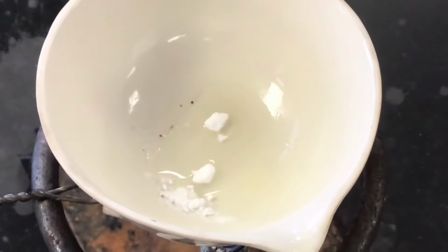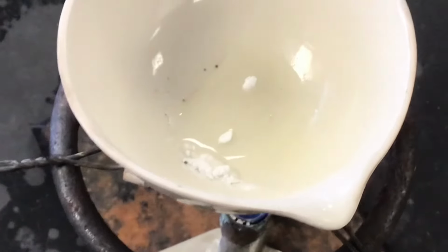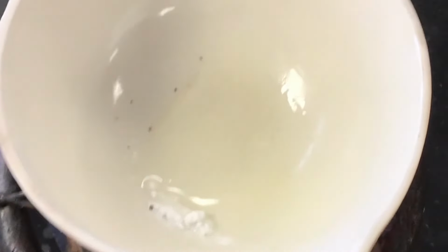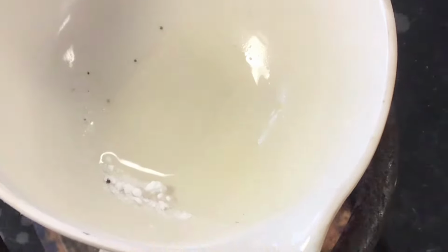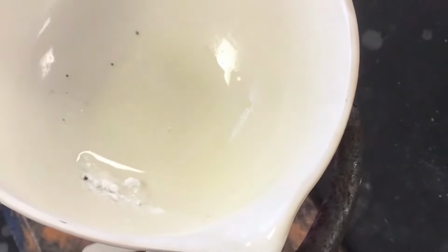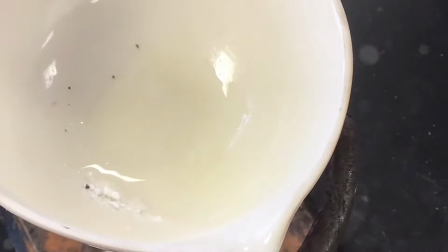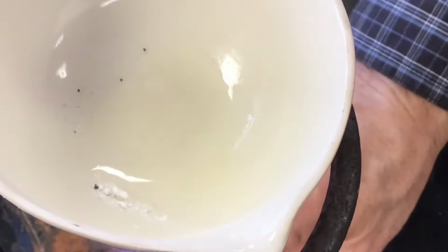Our Bunsen burner is a little anemic. It sounds like it's working hard. It is. Yeah, see that bubbling in there? Is the bubbling showing up? Yeah, we can see the bubbling. Some off on the edge here.